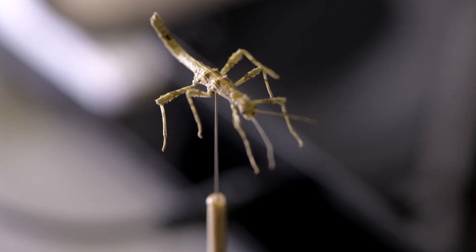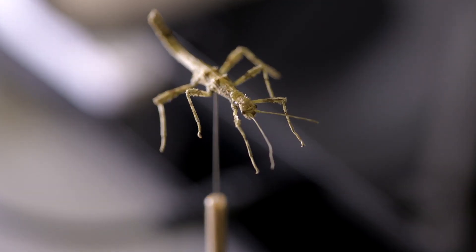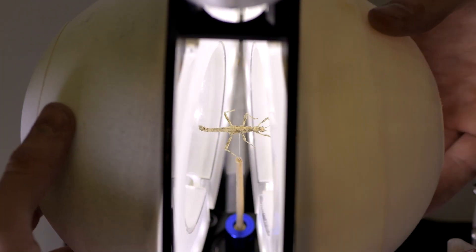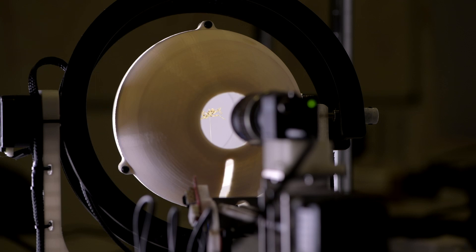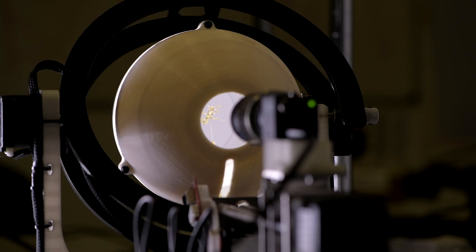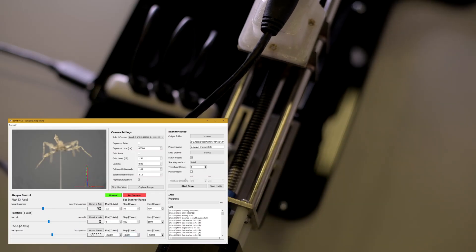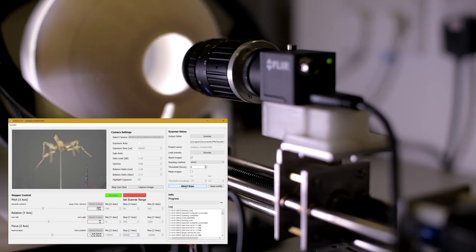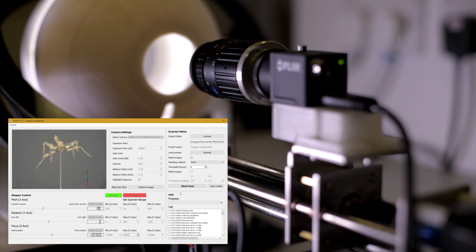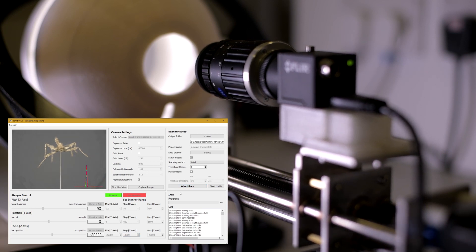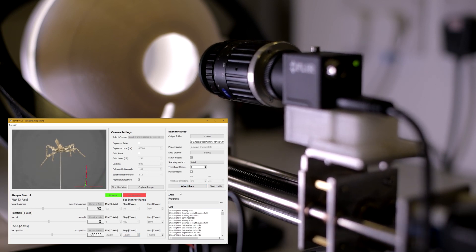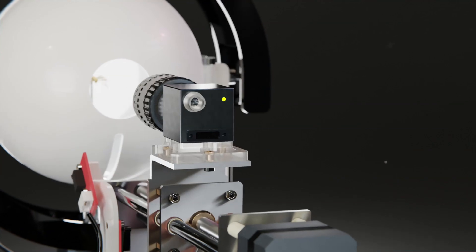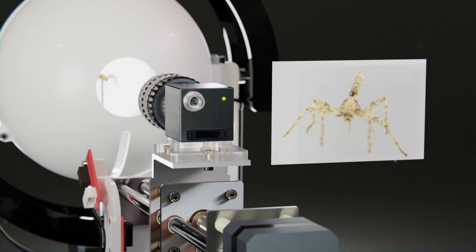Specimens are scanned by attaching them to a two-axis gimbal located inside the lighting chamber. The scanning process can be configured from a simple graphical user interface, which allows for full control over camera and motor settings and includes software capabilities for automated focus stacking and random forest-based background removal.